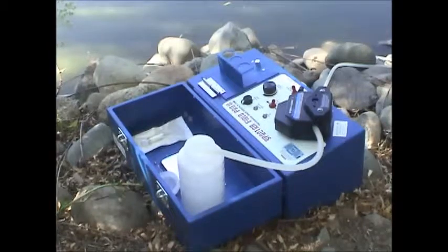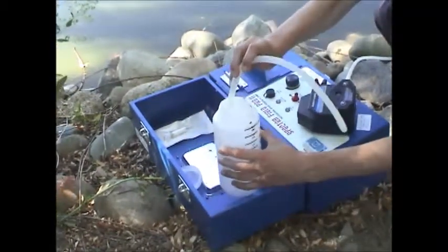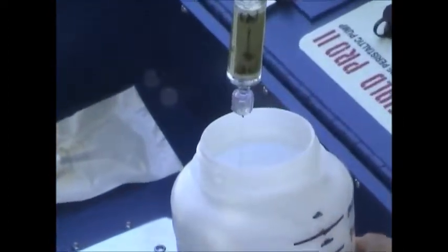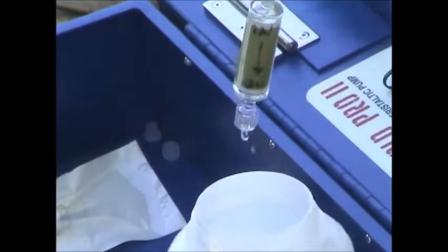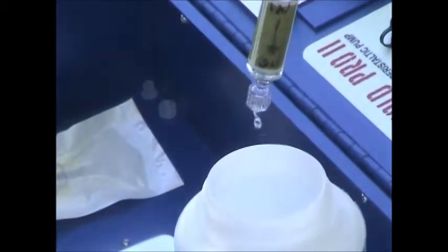As you start to get water flowing through that line, you can adjust the rate a little bit. If you have a lot of material in the water, the flow rate is going to drop down pretty fast. As you can see, we adjusted the rate up a little bit.